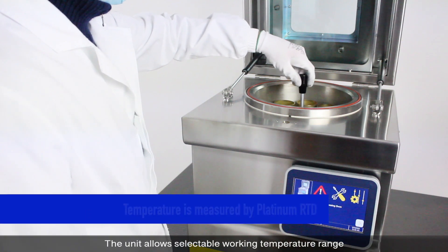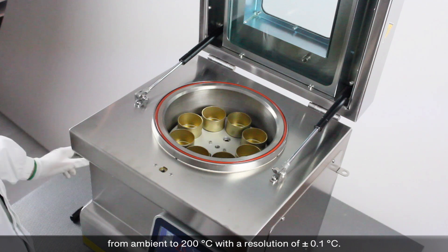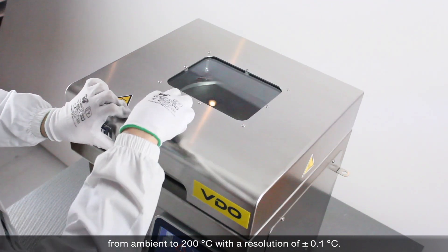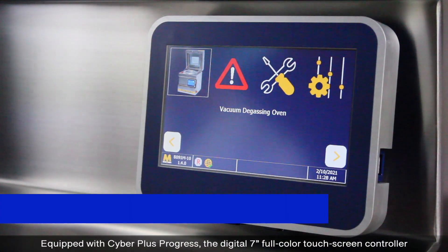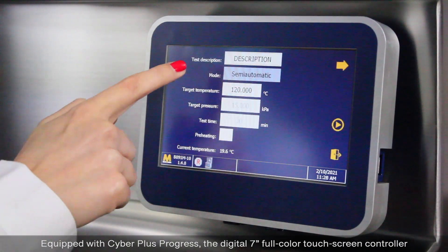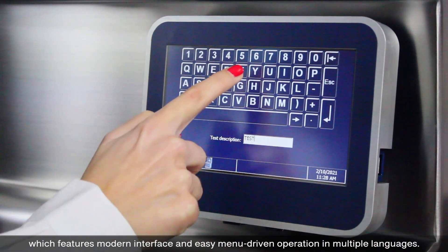The unit allows a selective working temperature range from ambient to 200 degrees Celsius with a resolution of plus or minus 0.1 degrees Celsius. Equipped with Cyberplus Progress, the digital 7-inch full-color touchscreen controller features a modern interface and easy menu-driven operation in multiple languages.